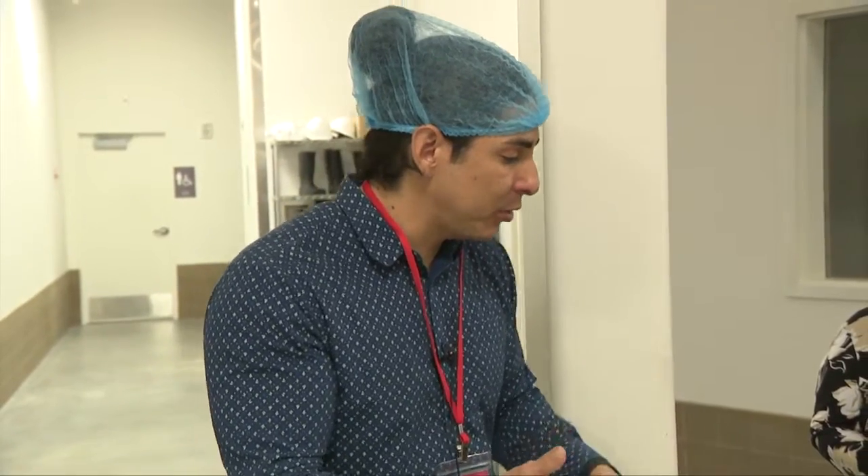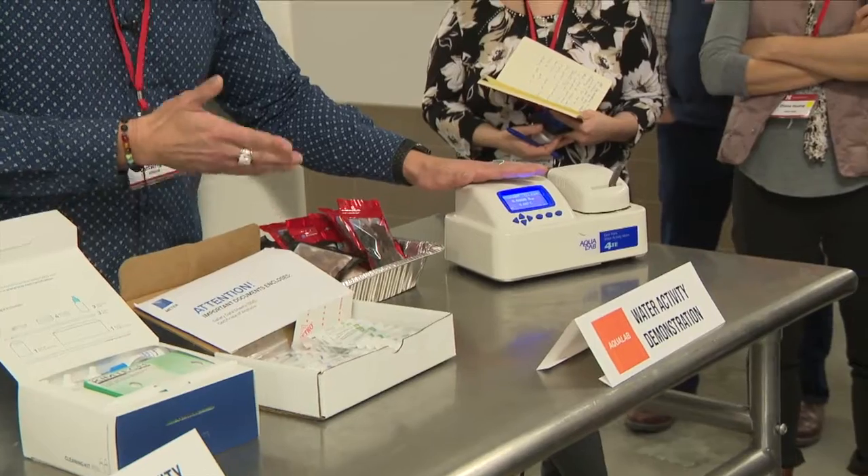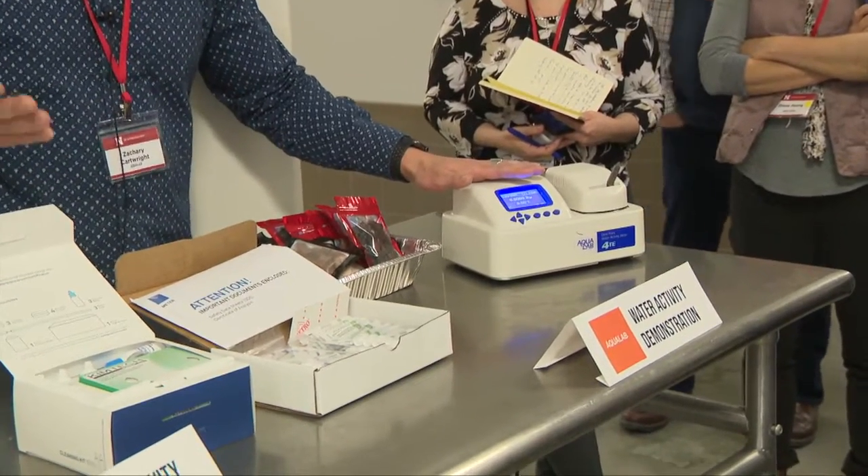You would just prep the sample, put it in here, and in maybe three to five minutes you would get a reading and then move on to the next sample.